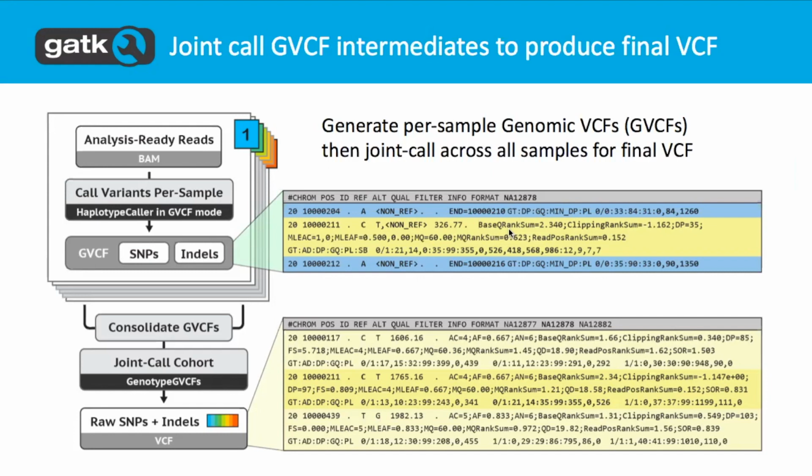So think about it. If you had multiple samples in your data set, and you had one variant, and you compare that variant to other samples, how do you know? Okay, so you have multiple samples, and one of the samples has a variant.